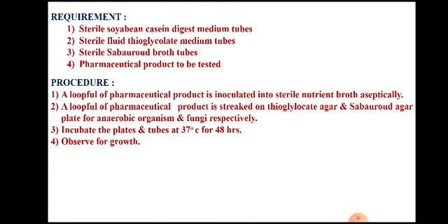So the procedure is very simple. There are two techniques. If the sample is available in large volume, and if it is a flowable liquid, then the membrane filtration technique can be used. And another technique, which requires a very small amount of sample, is the direct inoculation technique. All these techniques we already learned last semester. I want you to go back and read those notes as well.